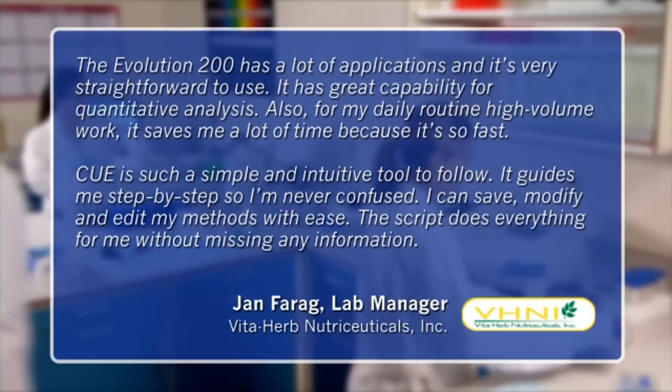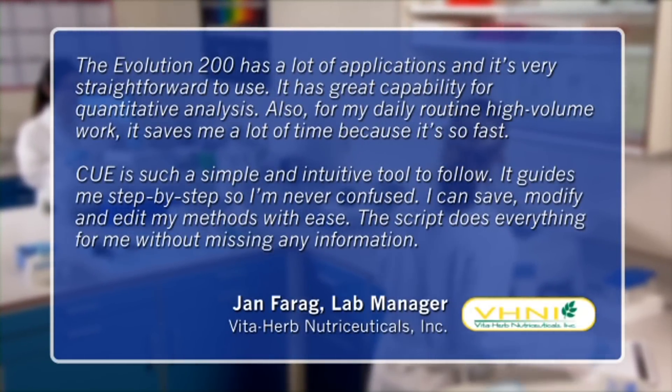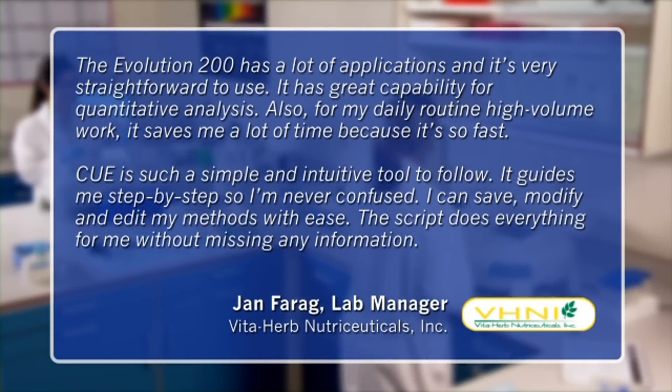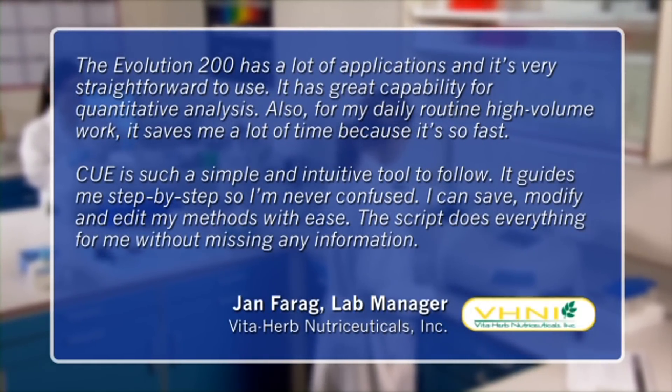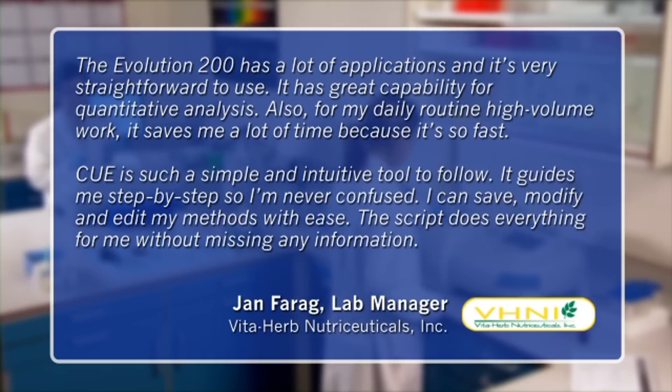The Evolution 200 has a lot of applications and it's very straightforward to use. It has a great capability for quantitative analysis. Also for my daily routine high volume work it saves me a lot of time because it's so fast.